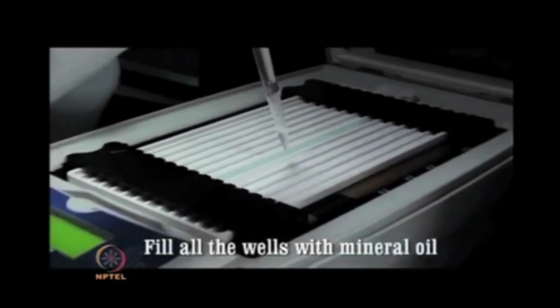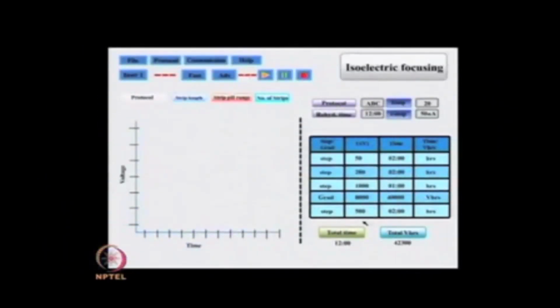Fill all the adjacent wells with mineral oil to ensure uniform current flow.